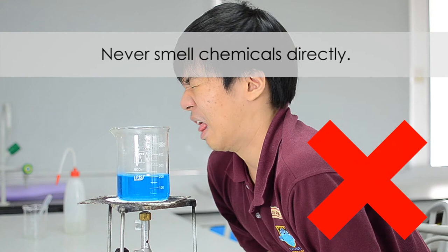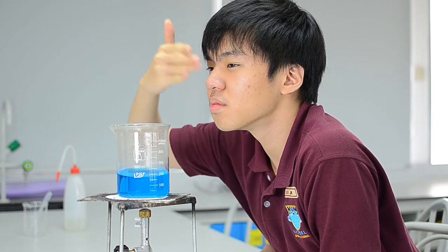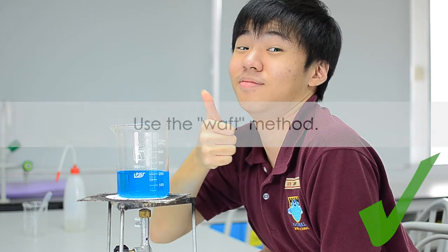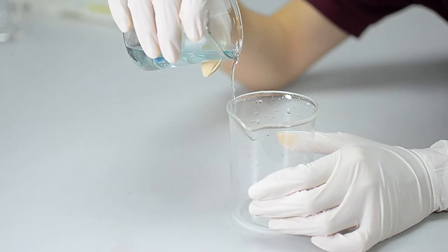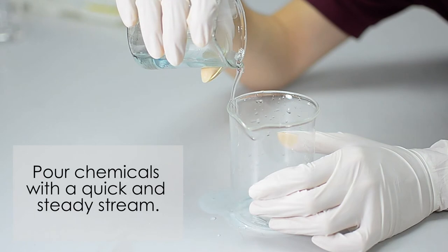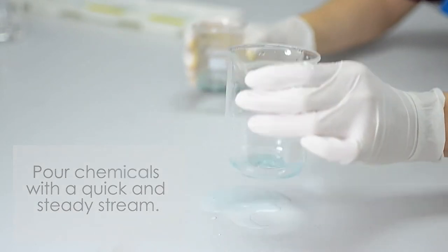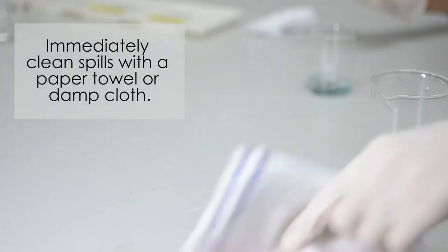Never smell chemicals directly, as they may emit fumes that damage your lungs. Instead, cup your hands above the container and slowly waft the air towards your face. When pouring liquid chemicals, it is important to ensure that you do it with a quick steady stream and not like the one in the video.